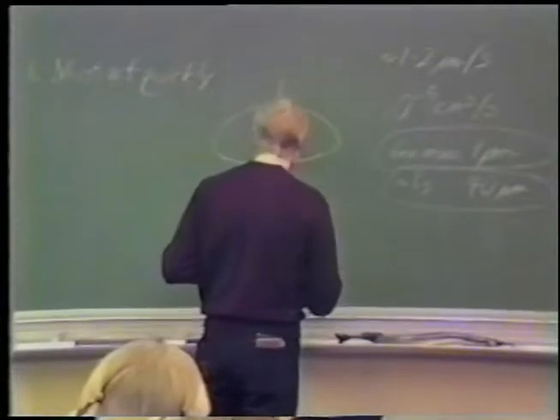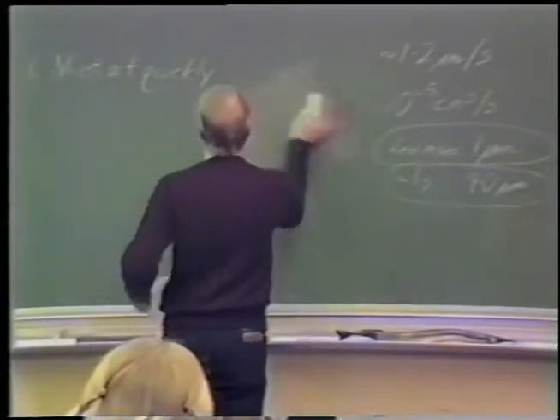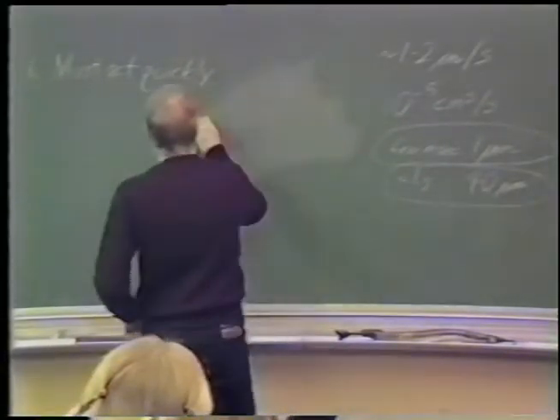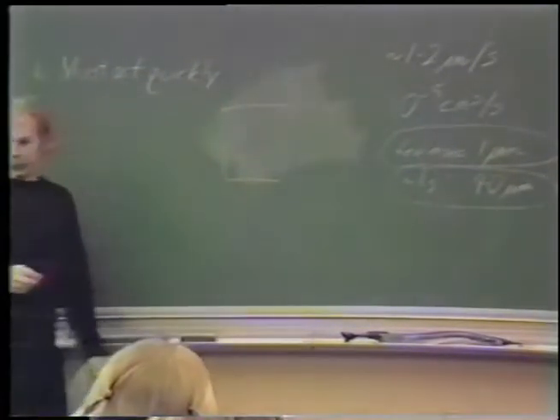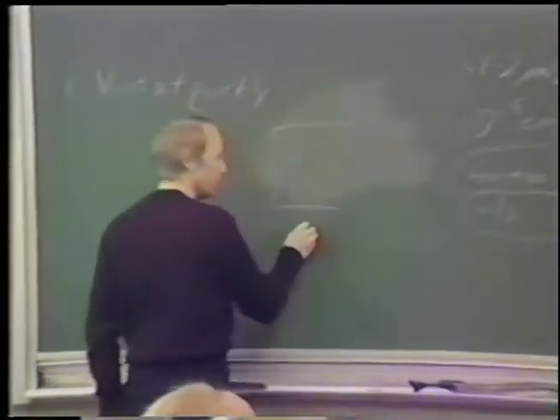How much time? Well, a few years ago, George Palade and his colleagues were studying the vesicle-mediated transport of materials from the capillary lumen to the abluminal side.